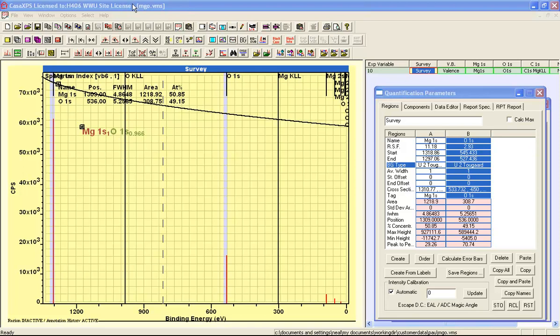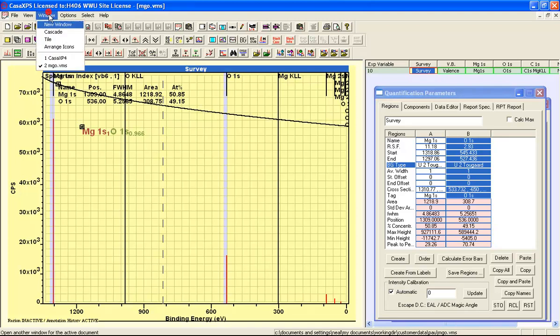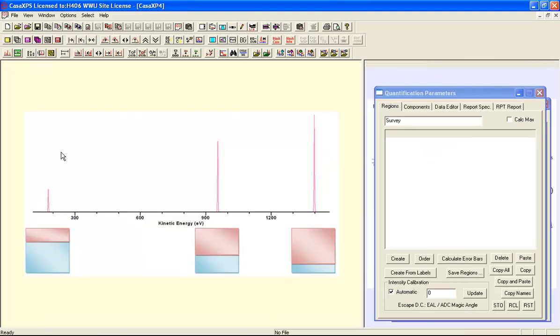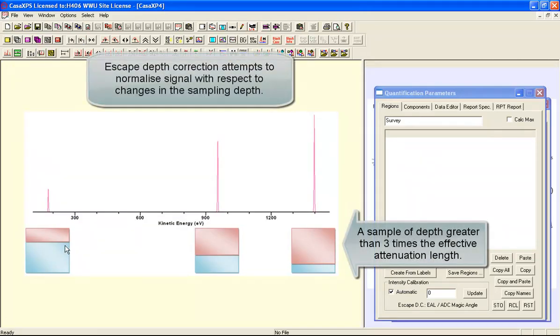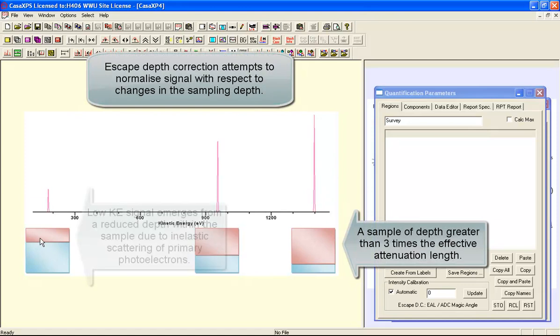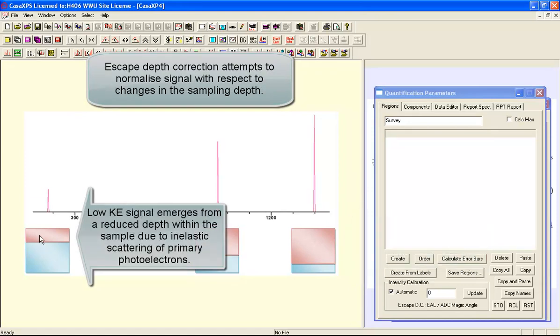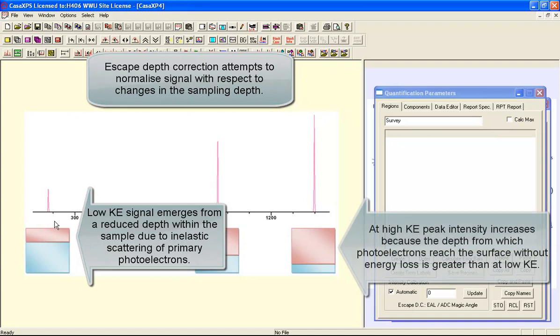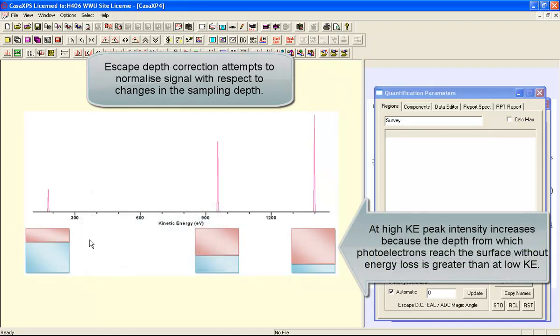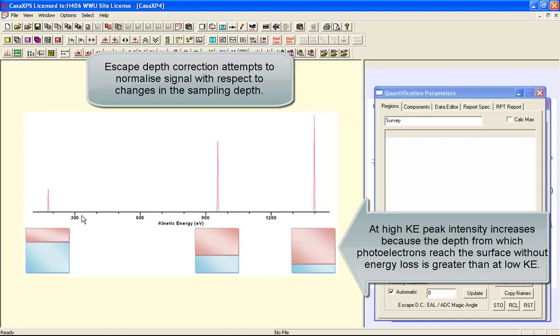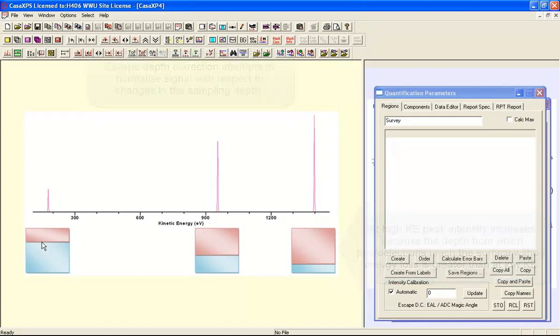So let's have a look at what happens when you have escape depth correction. So escape depth correction is considering the volume from which photoemission can occur. At different kinetic energies, the photoemission can come from ever-increasing depths as the kinetic energy increases. So if you had a photoemission process that was occurring at the same rate at different kinetic energies, then the size of these photoemission peaks would vary because the depth sampled due to the escape depth changes with each kinetic energy.